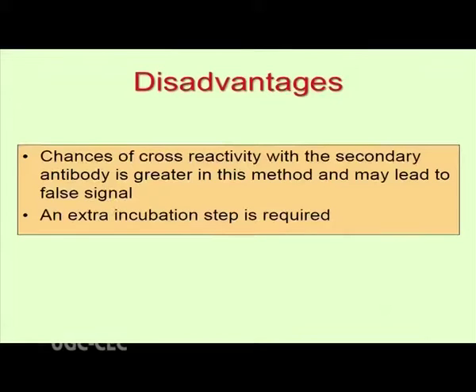What are the disadvantages of indirect ELISA? Since we are using two antibodies, the chances of cross reactivity increase in this technique, and since the technique uses more than one antibody, obviously it will take more time, so extra incubation step is required here.